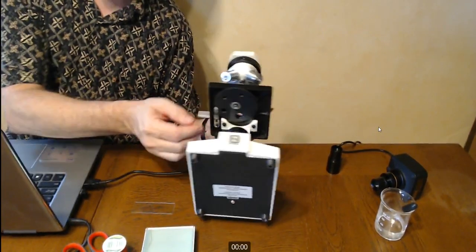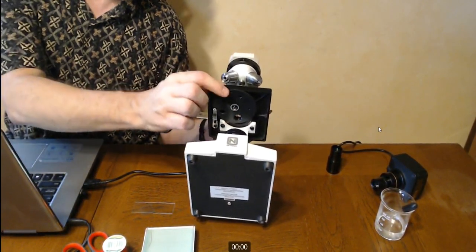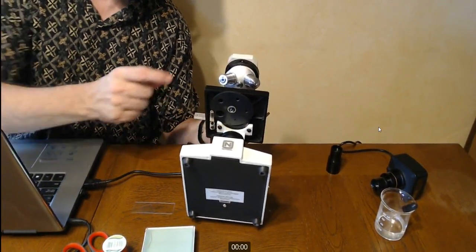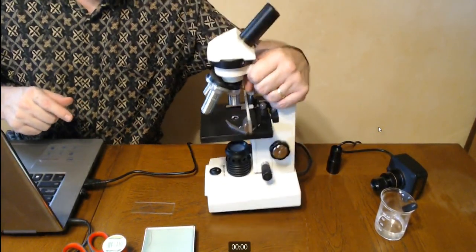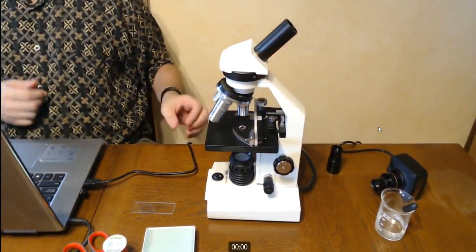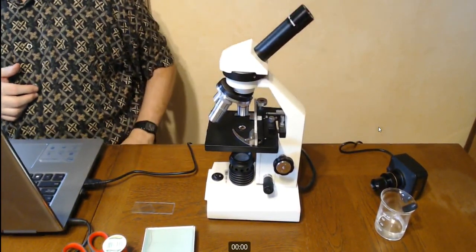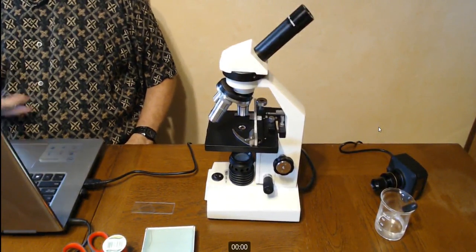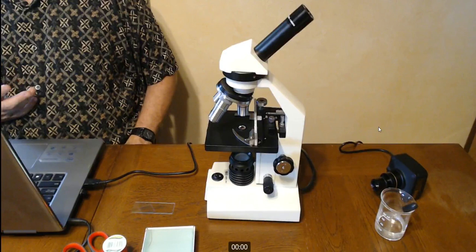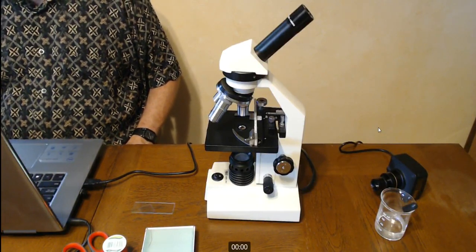I've got it on 5 right now and the largest hole is lined up, so 5 allows the most light through. If I go to 1, that's a tiny little hole, and that's the least amount of light going through. Why you want to do that is the more light you send through, the more color you get. The less light you send through, the more definition you get. There's times when you're looking for color, especially on prepared slides. Then there's times when you're looking for definition to see what you're looking at, see more of the grain.